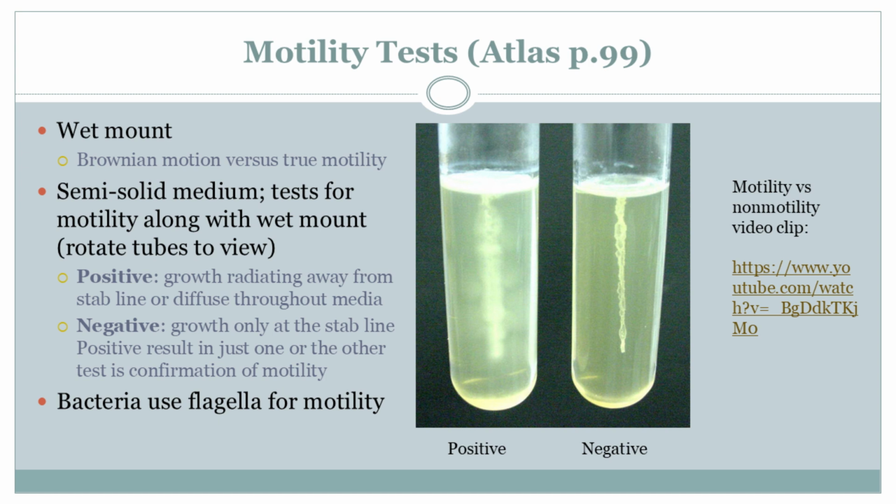Okay, so far so good. Then you just cover it with a thin cover slip. Think of it like putting a little protective shield over your tiny drop. Boom, wet mount. And that's it. Then we just stick it under the microscope and watch these little guys do their thing. Well, almost. You see, there's a difference between true motility, like actual swimming, and what we call Brownian motion.